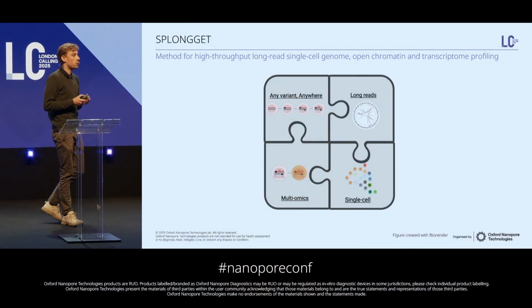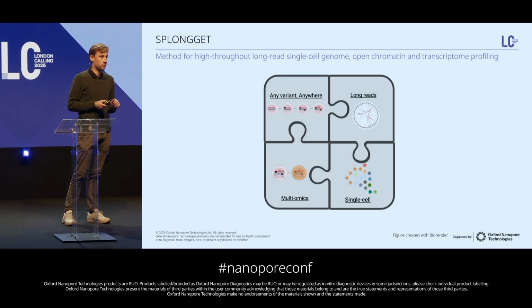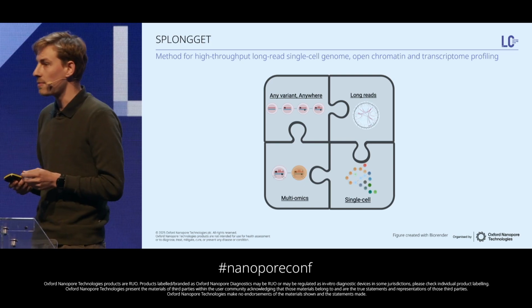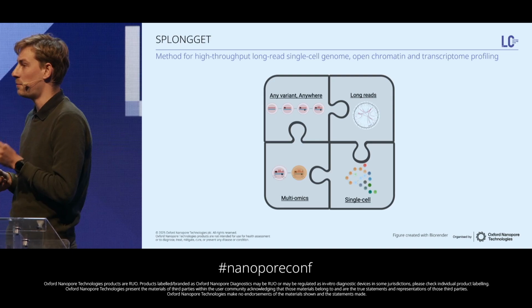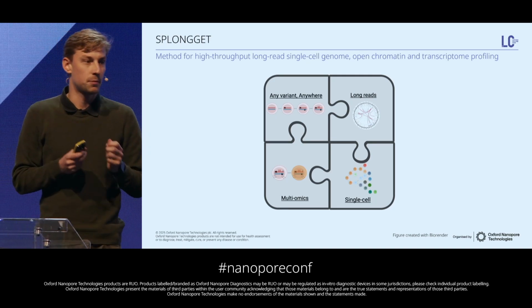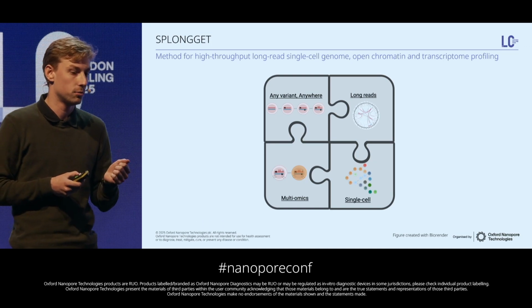Hi, I'm Ruben, a PhD student in the lab of Demeulemeester, and in our lab, we're mainly interested in charting tumor or somatic evolution. And actually, in the field of cancer genomics, we're quite fortunate as we've seen a boom of new sequencing methodologies in the last couple of years, especially on the level of single-cell and multiomics. However, one thing is still missing, and that's an accurate, high-throughput multiomics technique that is able to capture the vast amount of genomic mutations that arise in these tumors.